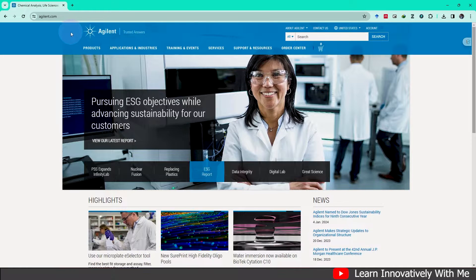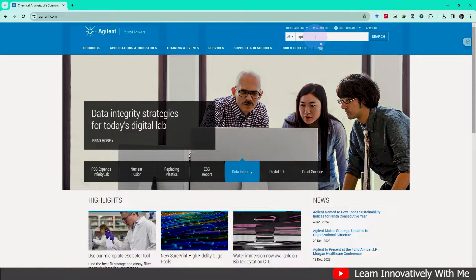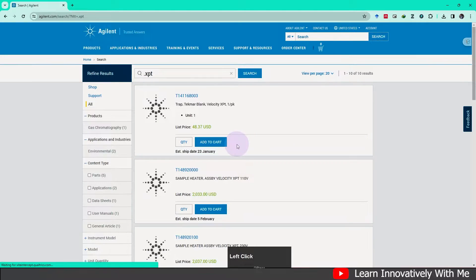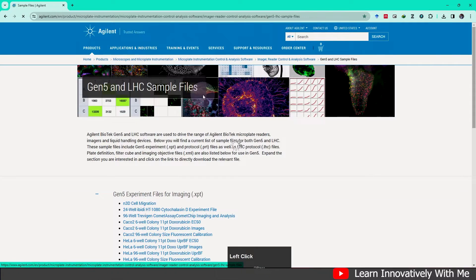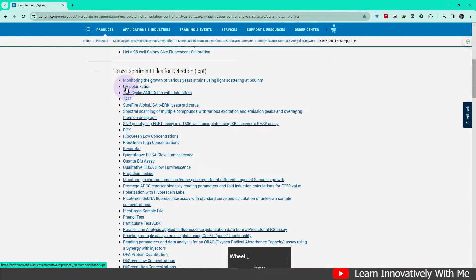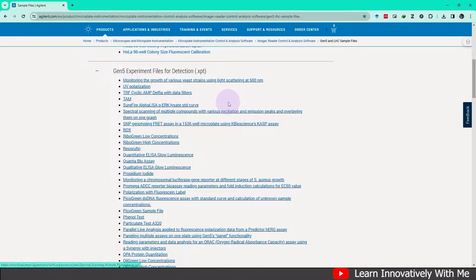First, I want to show you a very important data source. If you visit agilent.com and search in the search bar for '.xpt' — that is the extension file of Gen5 experiments — click search. If you scroll down, you can see Gen5 and LHC sample files. Click here on the plus button. These are example data files stored at the agilent.com website, and you can use these experiment files to learn about the experimental setup in Gen5 software.